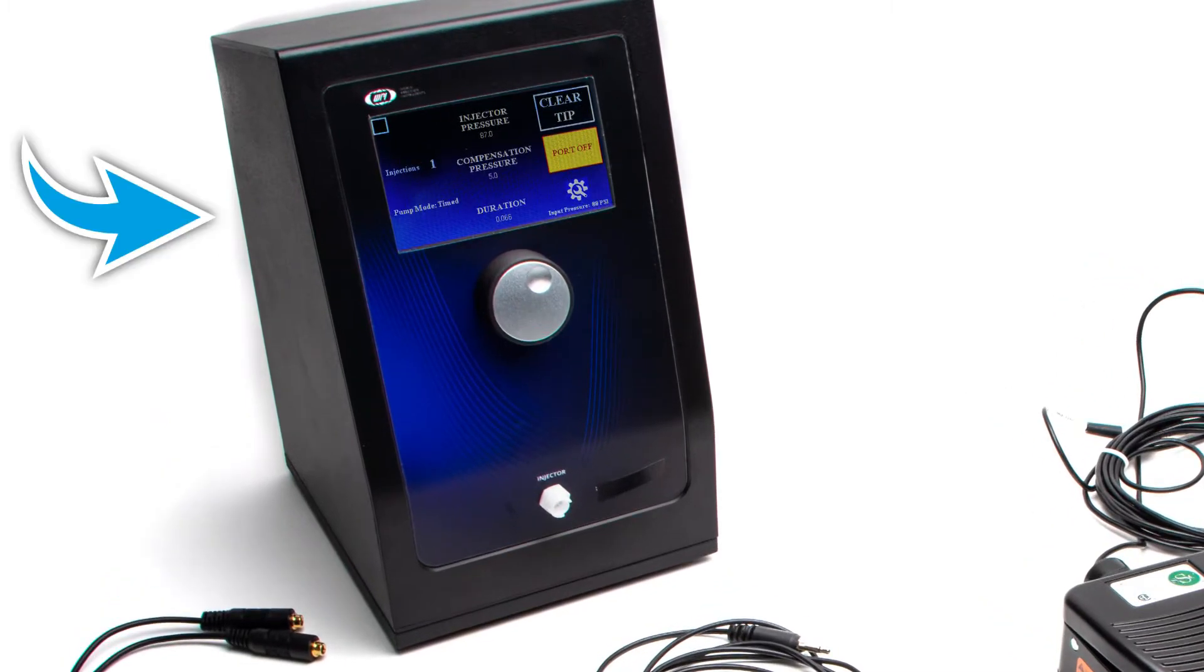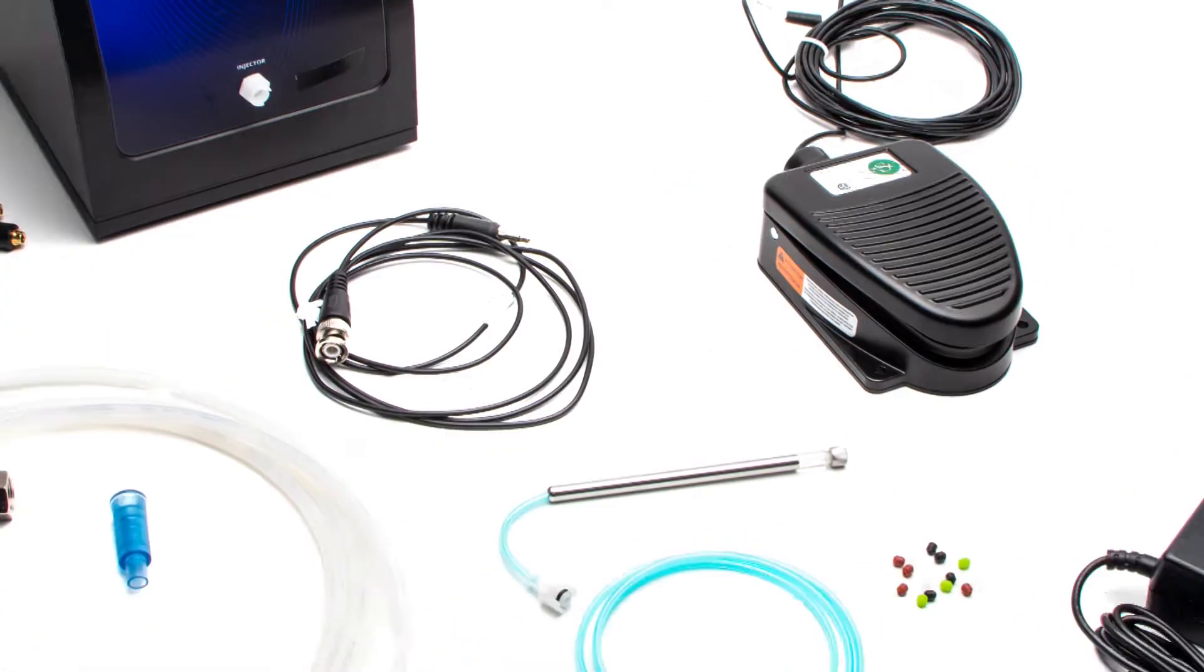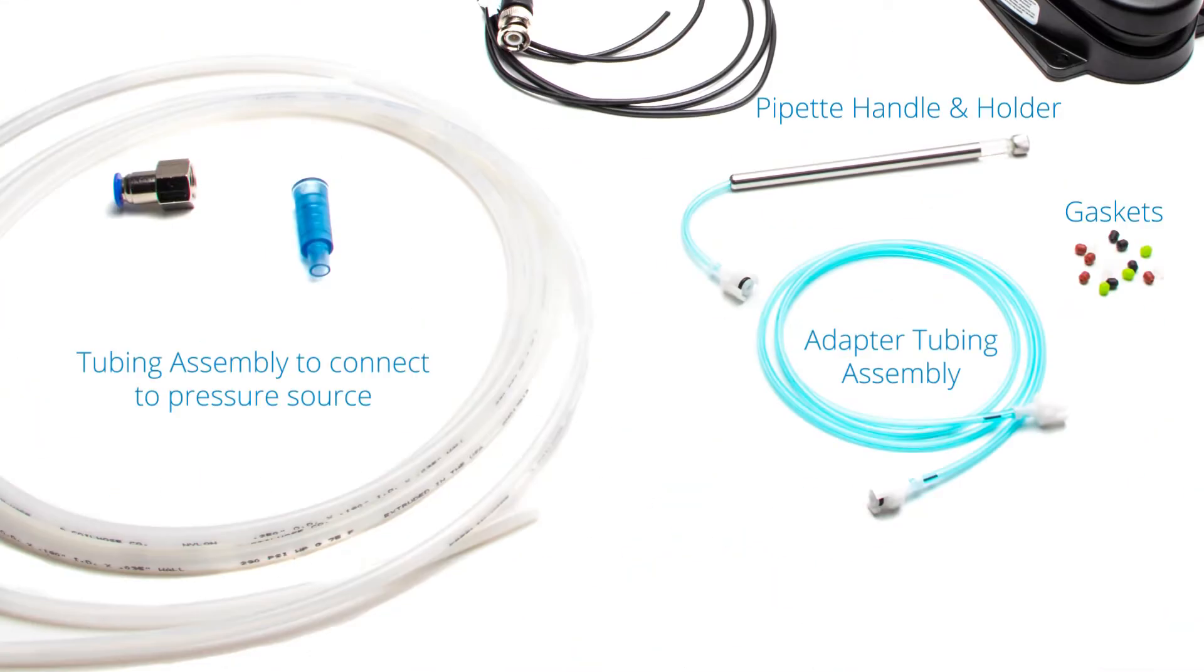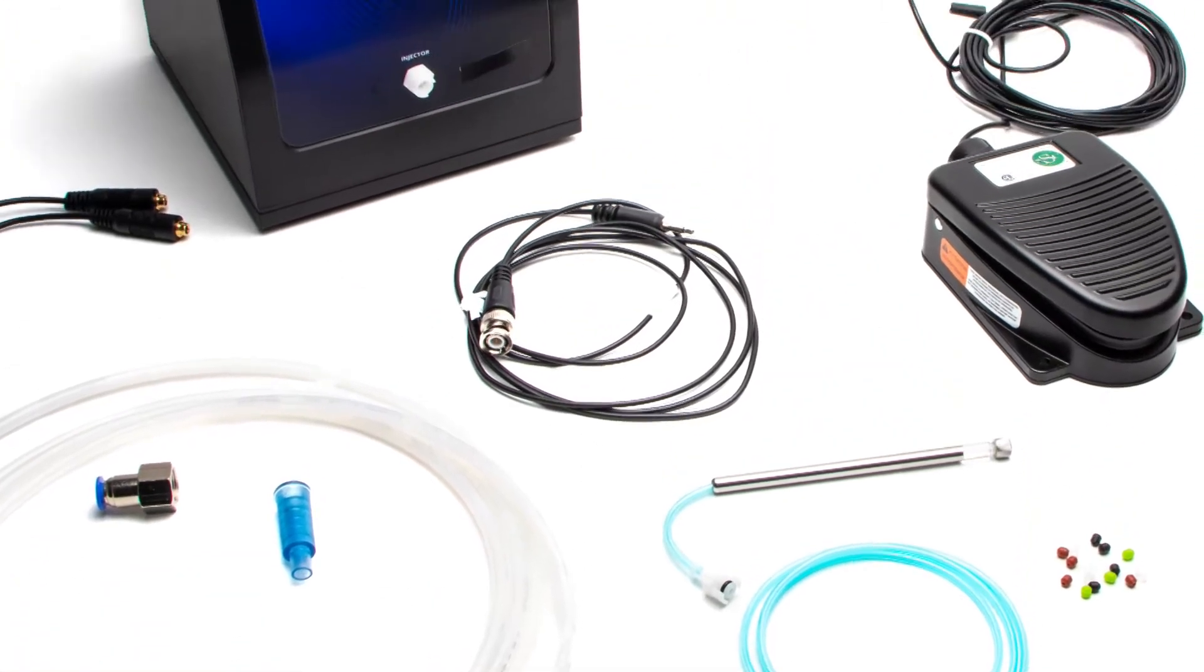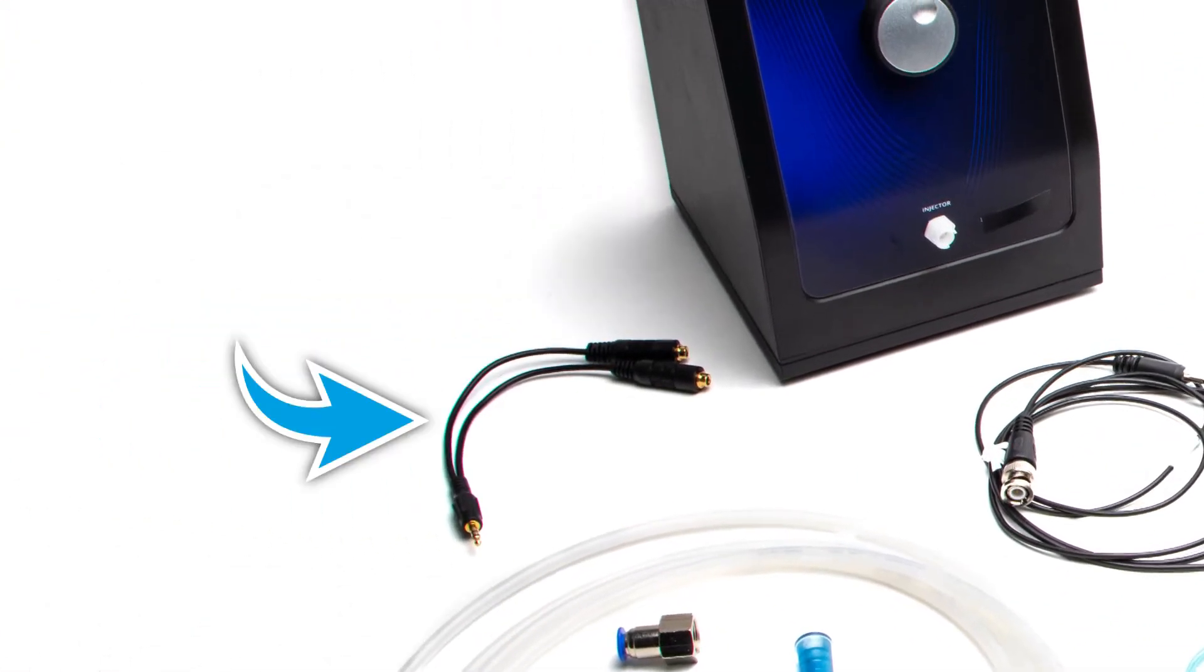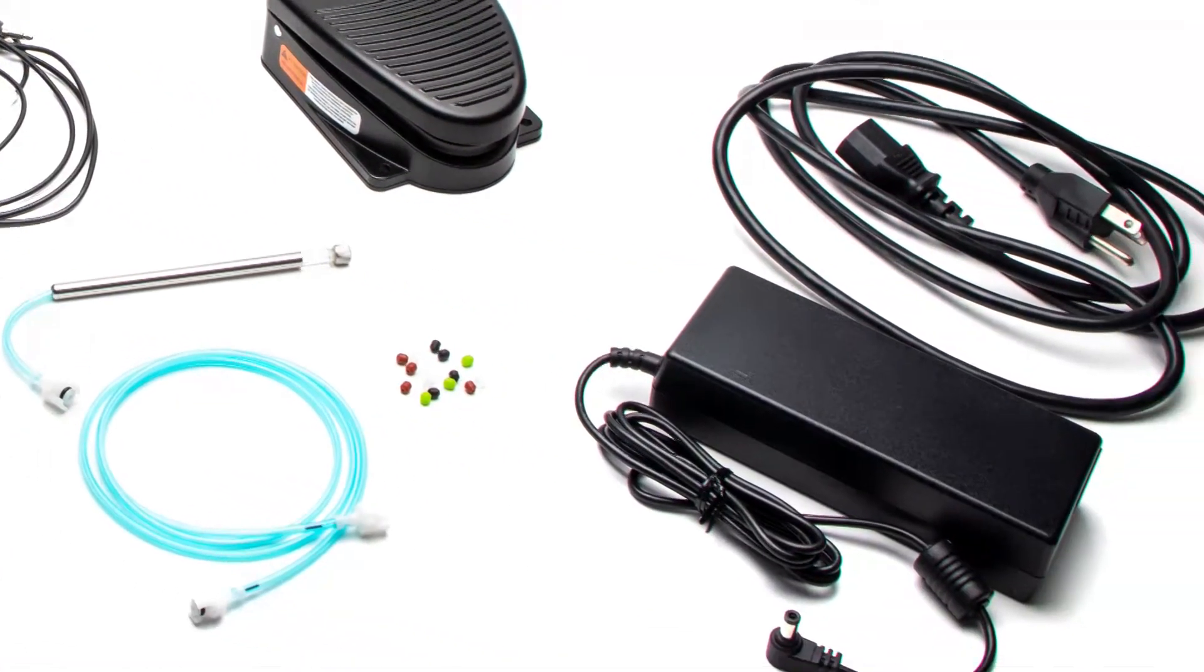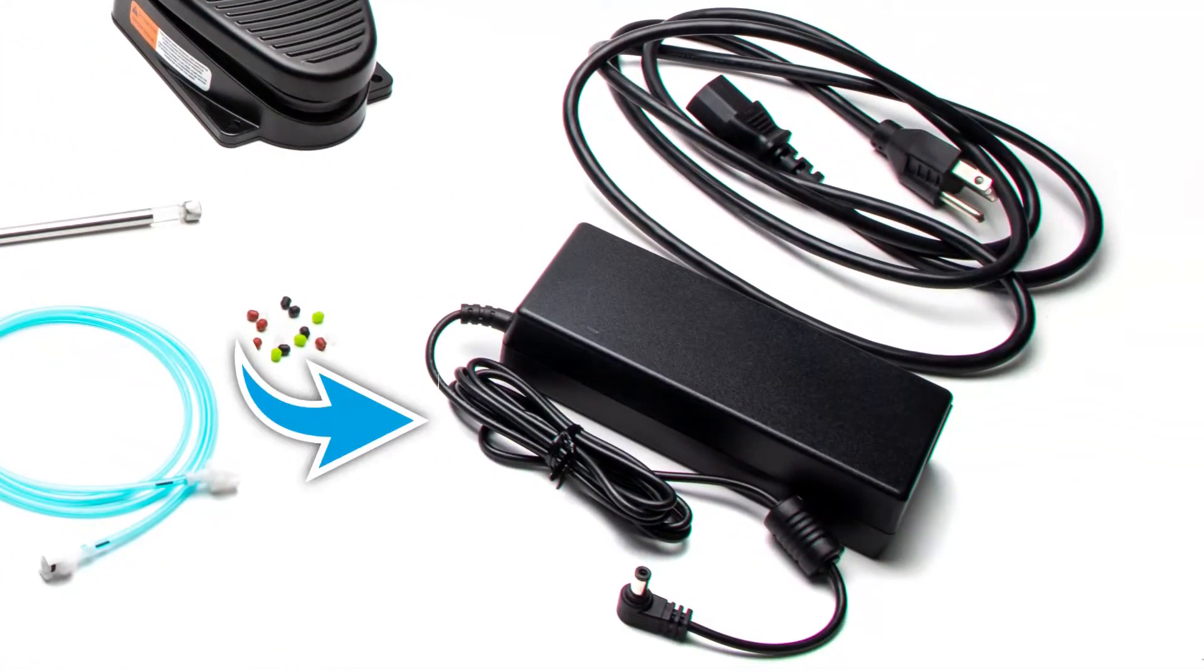The PV850 injector, a foot switch, the PV850 capillary kit, a six-foot BNC cable, a Y stereo splitter cable to connect a computer for TTL control, and a power adapter with a cord.